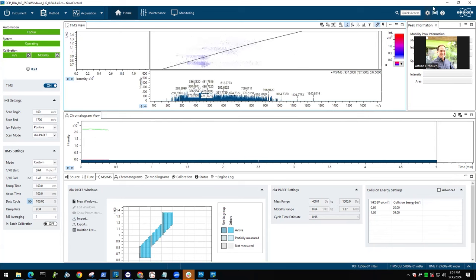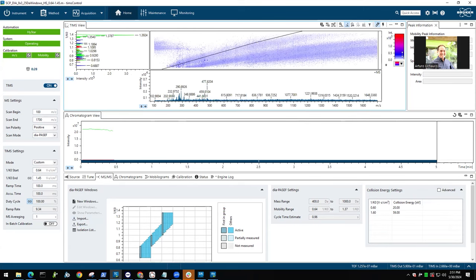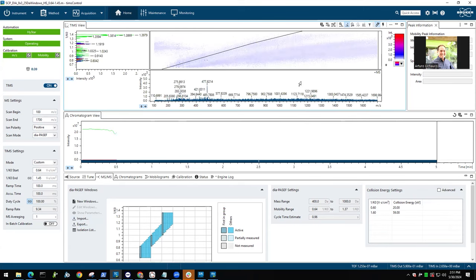To get meaningful data, we have to make sure that our TOF is calibrated and the mobility is in the right range. If the mobility is shifted, our range of selection would be outside of the range where our molecules are. And then, of course, IDs will go down.